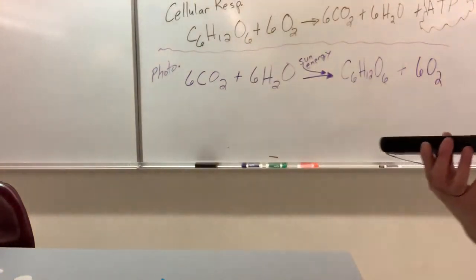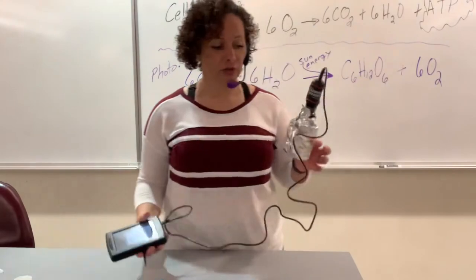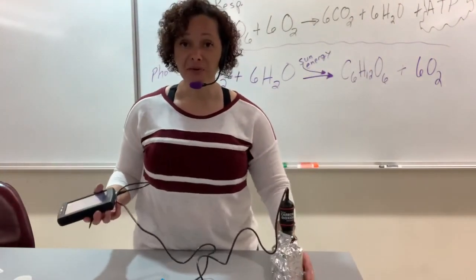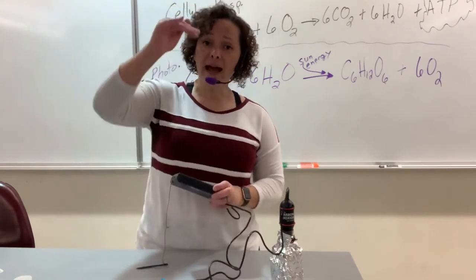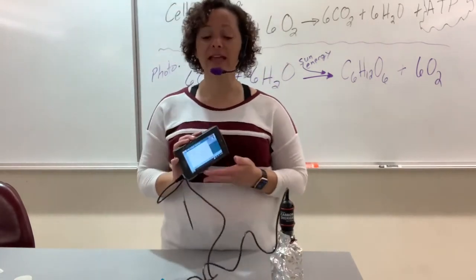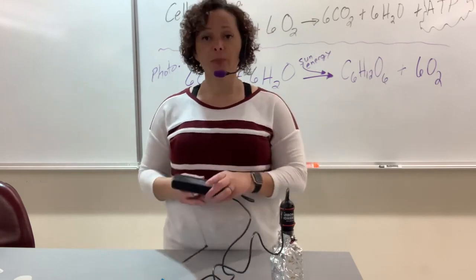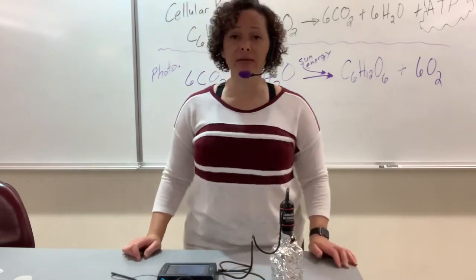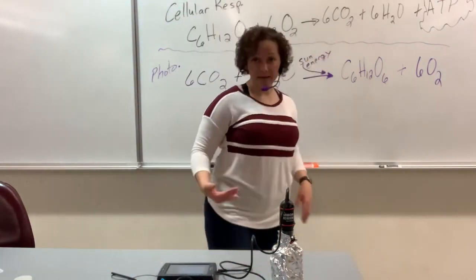Okay? So I'm just going to give it away. These peas have not been germinated yet, so my value is probably going to end up 0. But yours won't. Whenever you come in, yours will be germinated. And you're going to start to see a graph grow. Now, what this is doing, it is figuring out the respiration rate, the parts per million of CO2 gas that is taking place or being excreted over time.